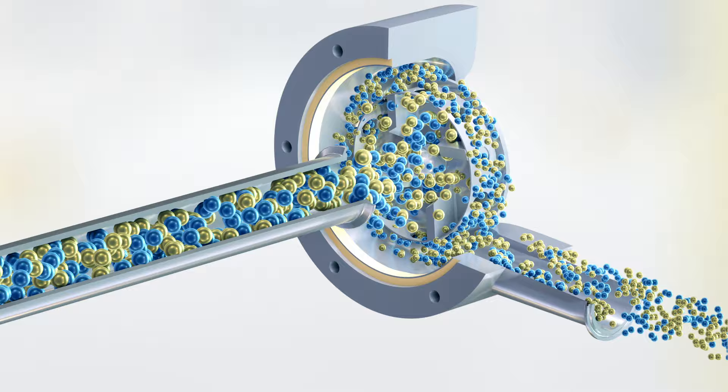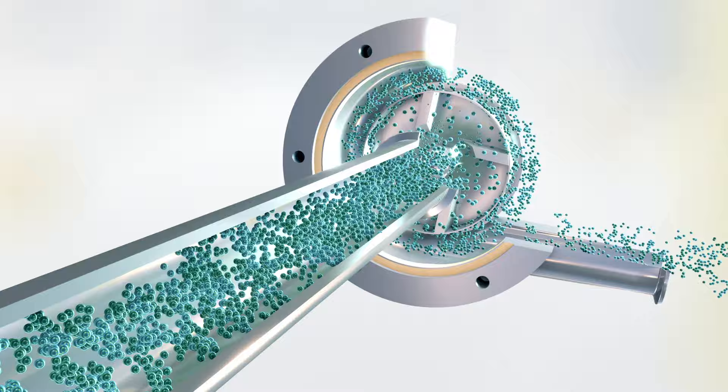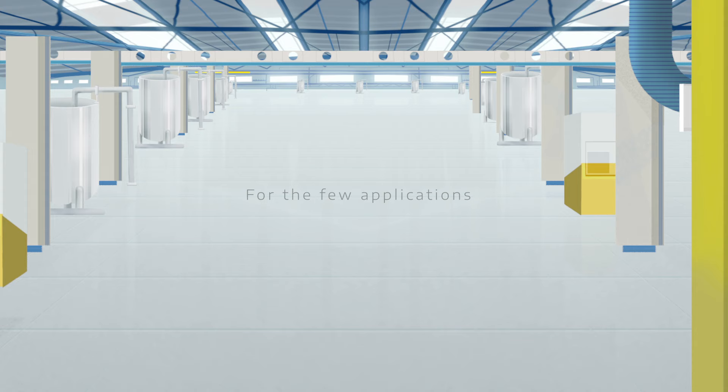This is followed by intense hydraulic shear as the product is forced through the stator screen and circulated back into the mix. Fresh material is continually drawn into the workhead progressively reducing globule or particle size and quickly resulting in a homogeneous, uniform product.